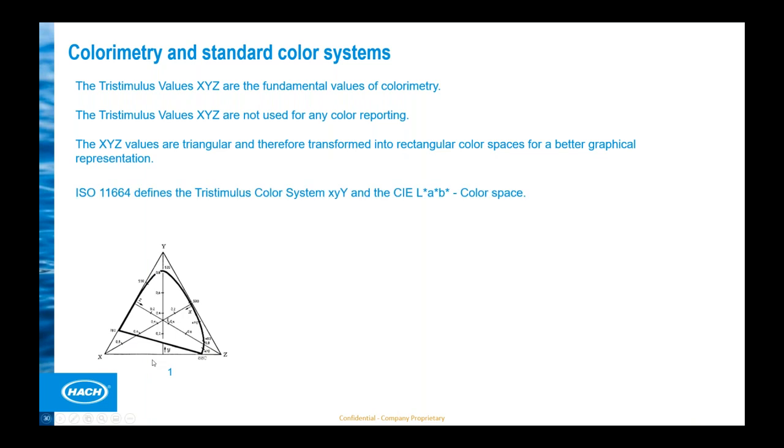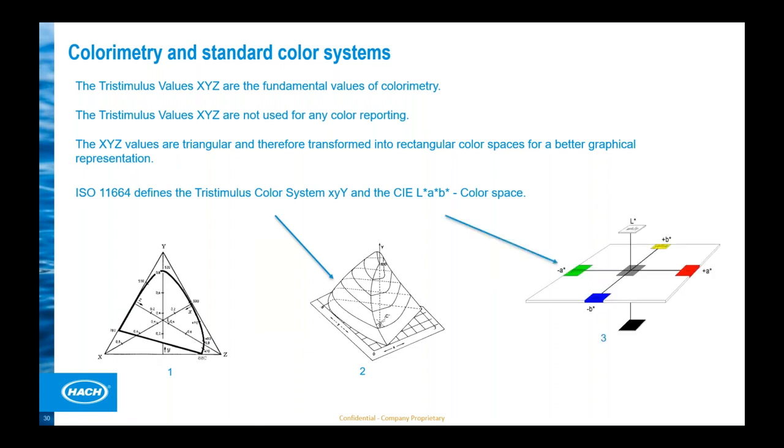The first developed color system was the color system xyY, developed in 1933, last century, and used for a very, very long time to measure colors and to make color graphs, so you could measure the XYZ values and then put that into this graphical system.